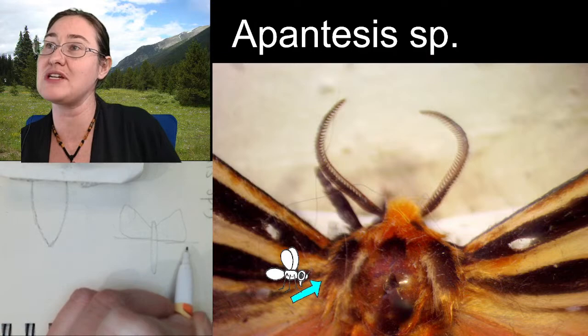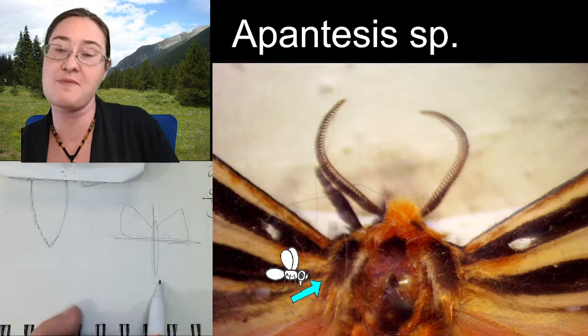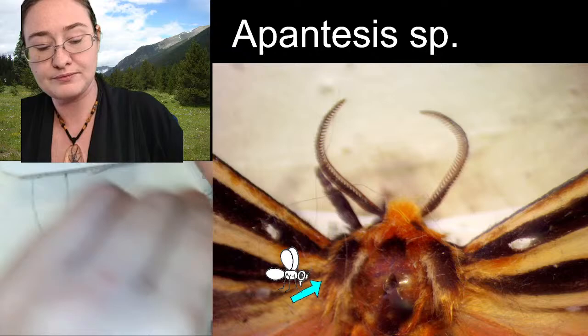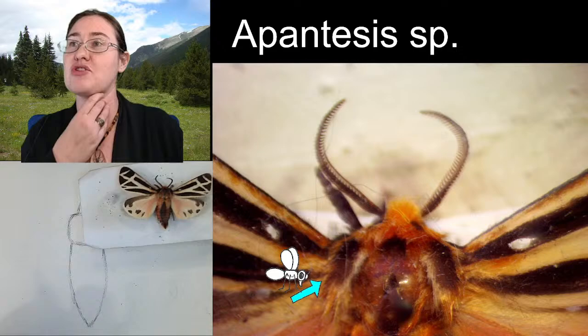On every butterfly or moth that is pinned properly, there is going to be a 90-degree angle from the head, from the body to the bottom side of the front pair of wings. There isn't really as much of a rule on the hind pair of wings, except that you want them even. So you can choose to leave them tucked up underneath the front wing a little bit more, or you can choose to pull them back a little bit so you can see all of the features. It's essentially pinner's choice at that point.